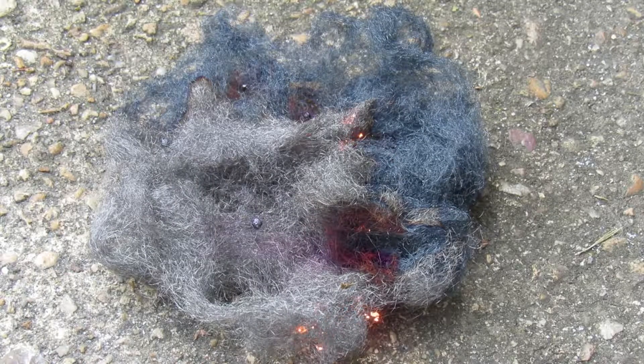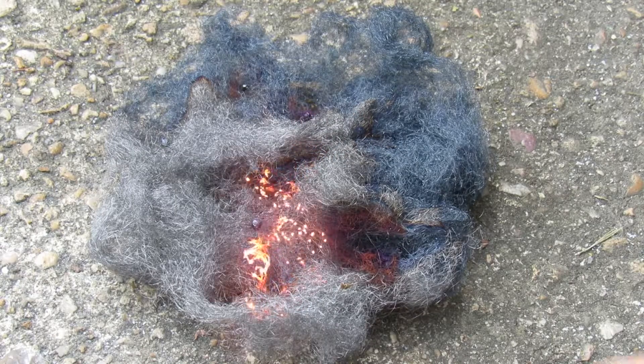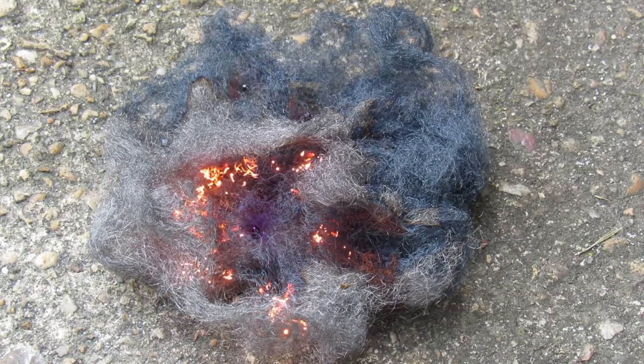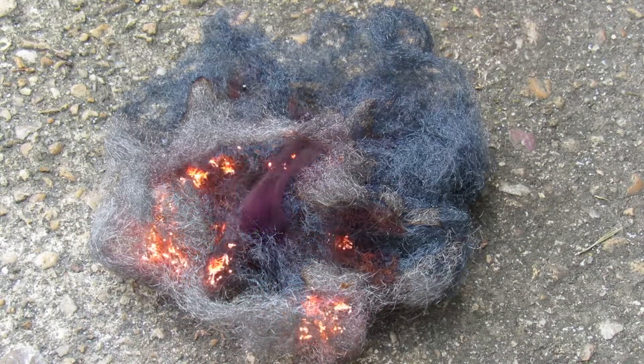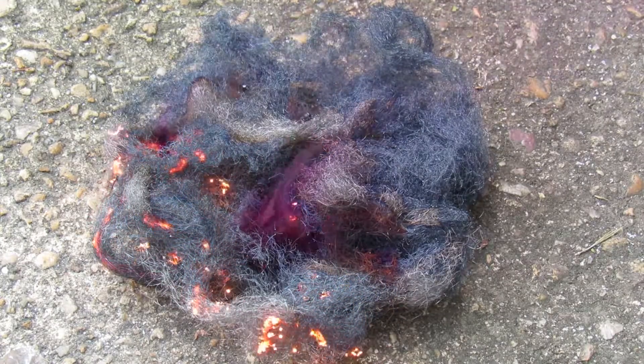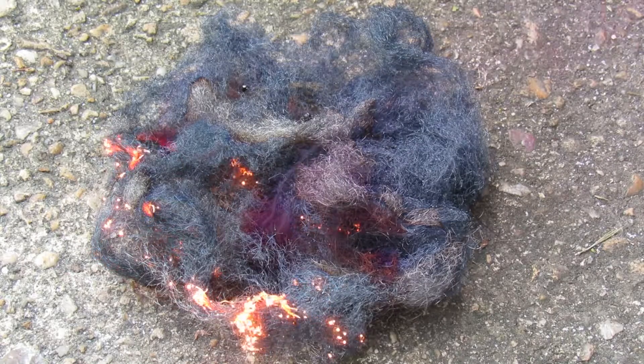These fireballs are still spreading on the bottom there. You can see the rust developing here where the iodine was. Look at it go, it's still going crazy. There's another couple of iodine prills — look at that purple gas, remember don't breathe it.